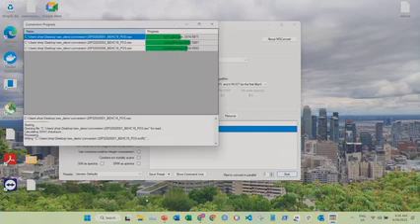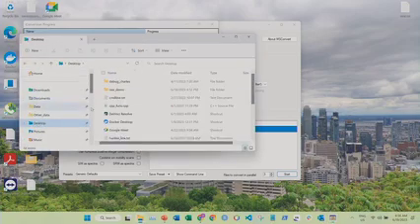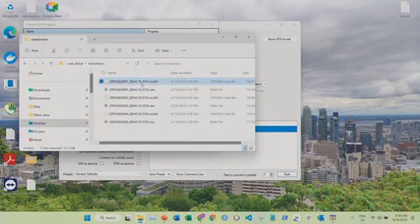After we finish the conversion, we can see the result will be something like this. It's going to be mzML. It's really small. Usually the raw data is more than 100 megabytes because this is very complicated serum data, but after the conversion it becomes very small.